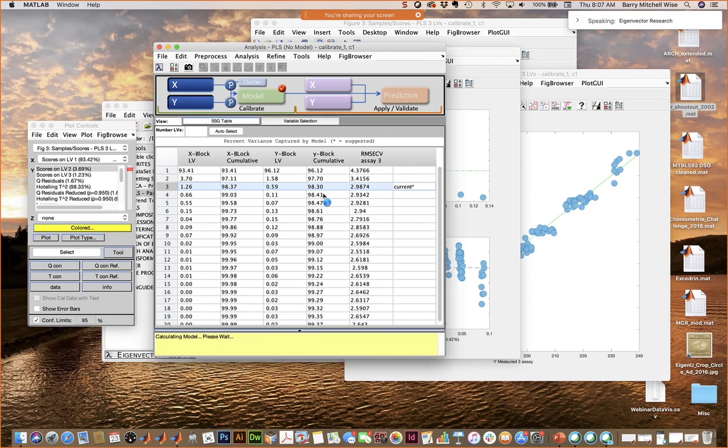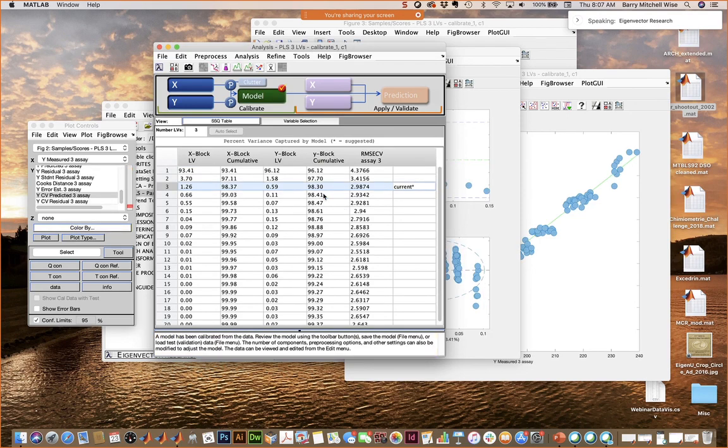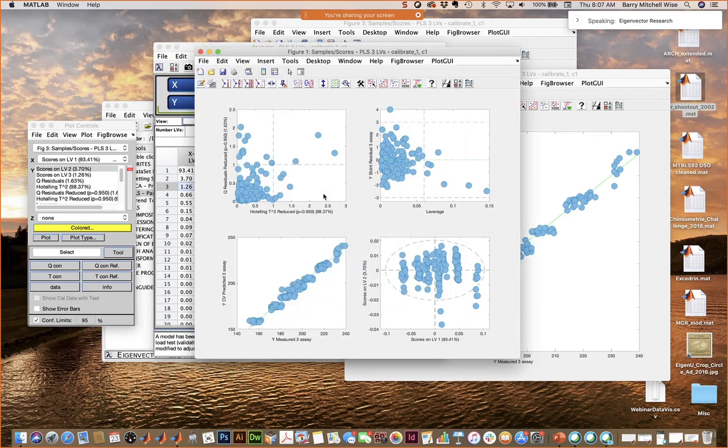We had a couple more questions, some of the details about plotting. When you're using color by, you're plotting along an axis. Is there a way to plot along a shape axis, like a number of sides of a polygon for different symbols?